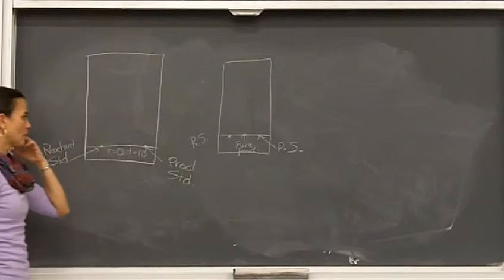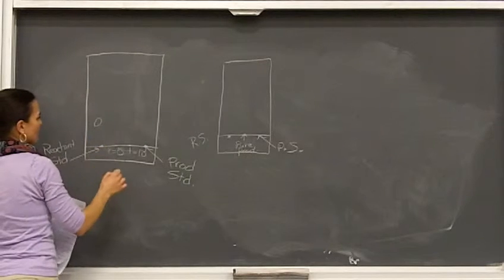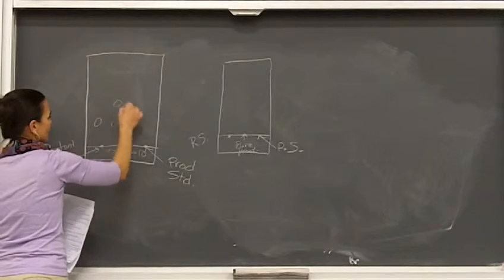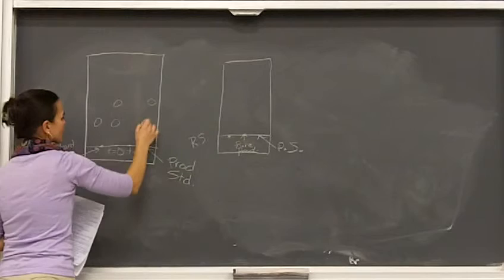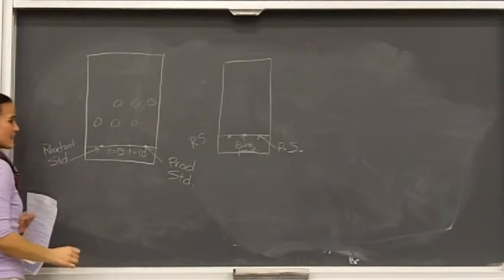Okay? So here you may see things, you know, here's, for example, the reactant standard. You might see something like this. Here's our product standard after time 0. Hopefully it's more times, something like that.